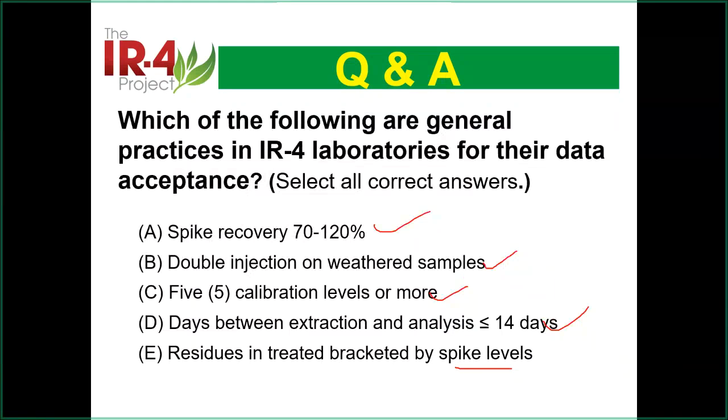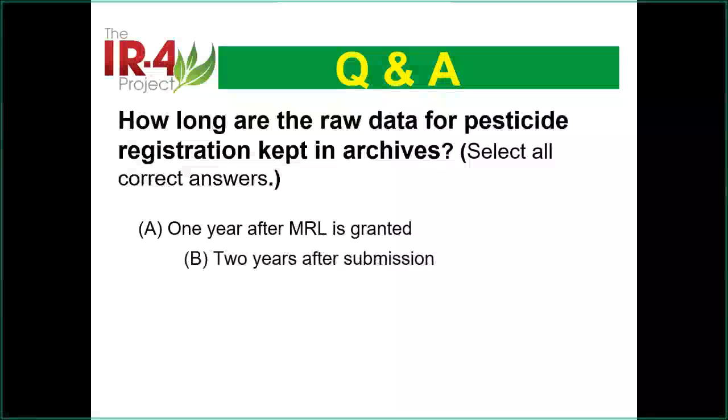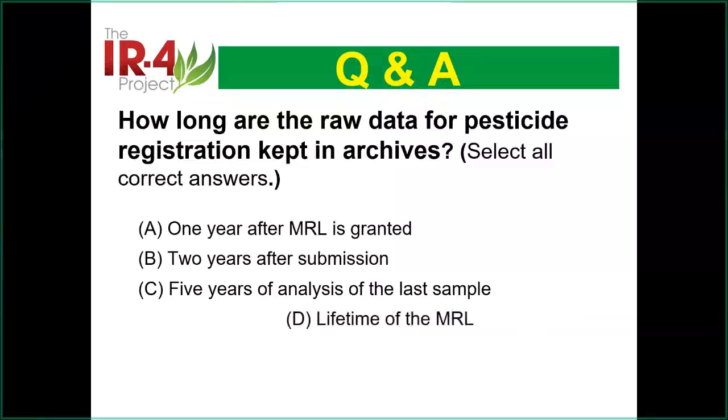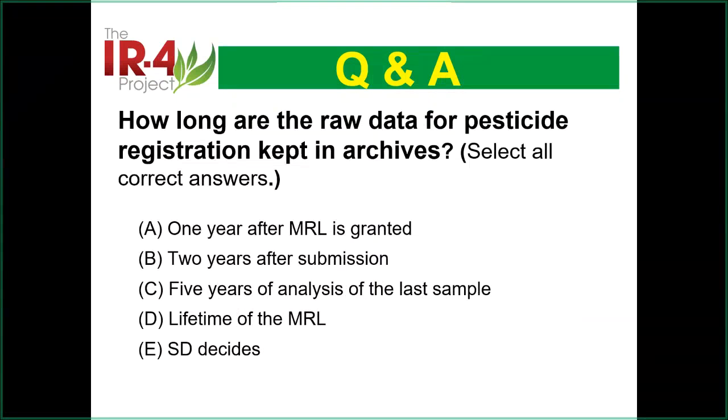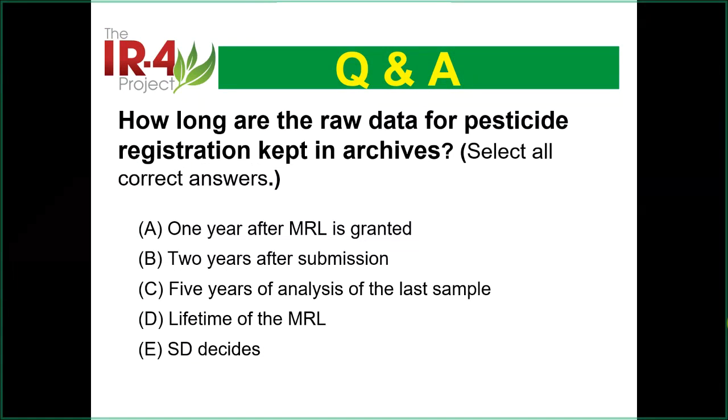So we have other questions there. Let's say for your data archives, how long do you keep the data? In some places, because there's limited space, the facility has rules that say you just need to keep it for 5 years or 3 years.